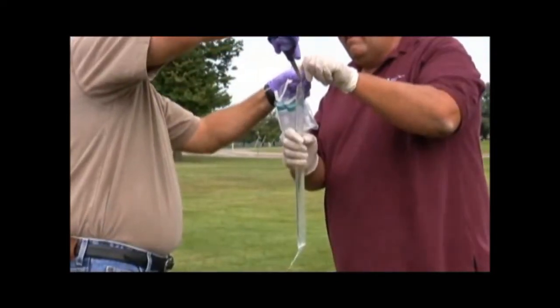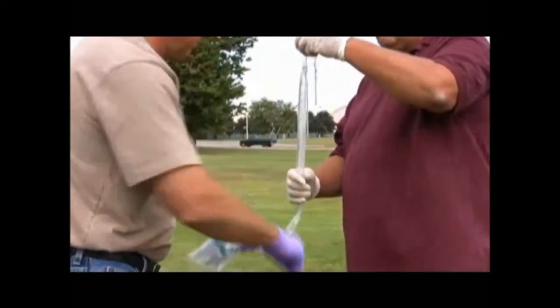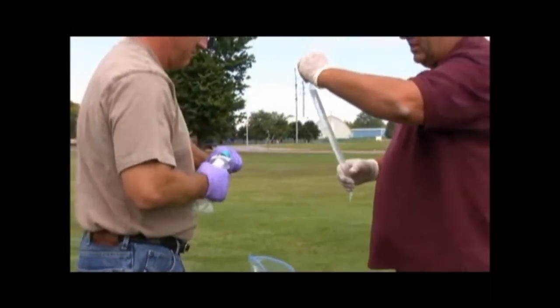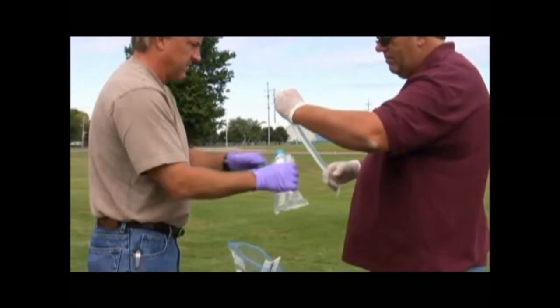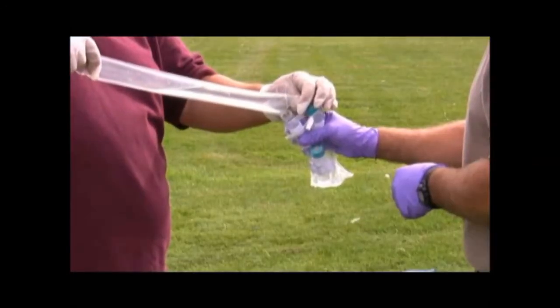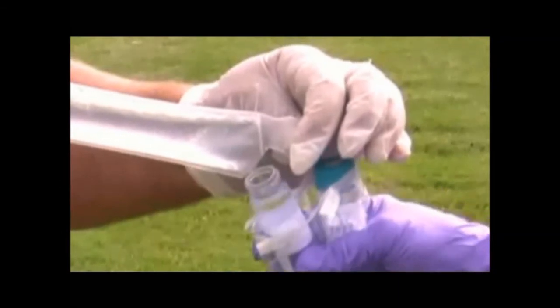Using decontaminated scissors, cut a notch in the corner of the bag. Slowly pour water into vials. Minimize agitation and ensure no head space is left.